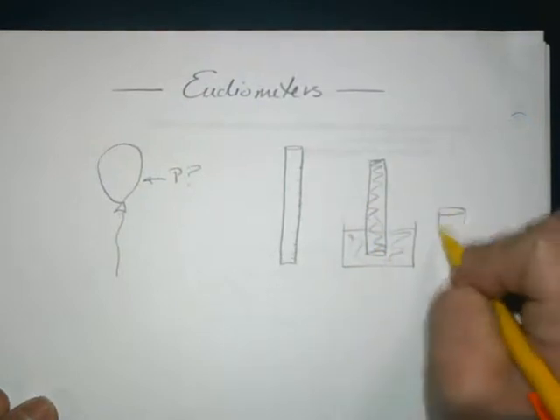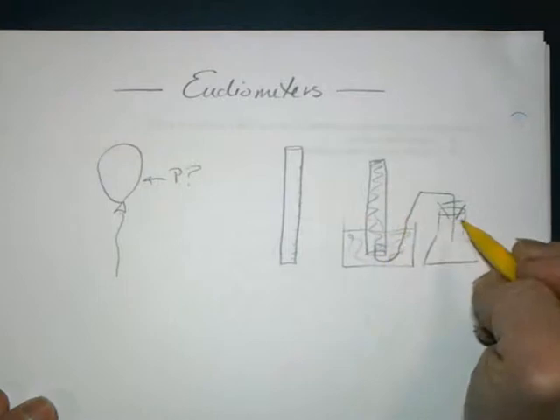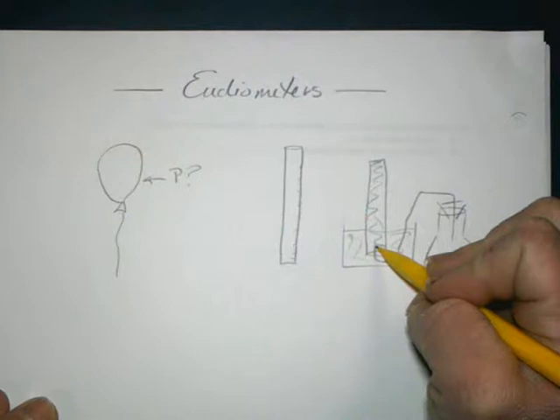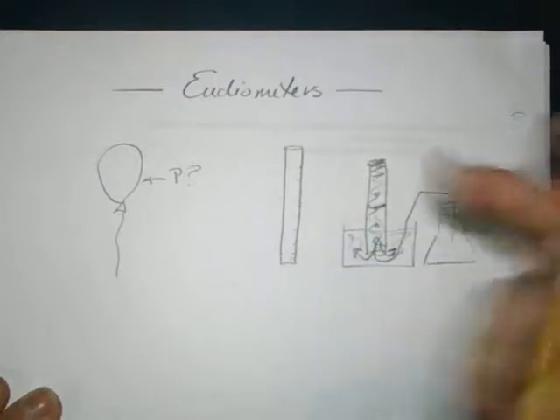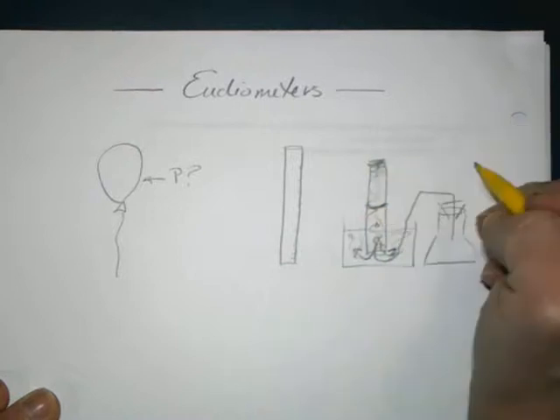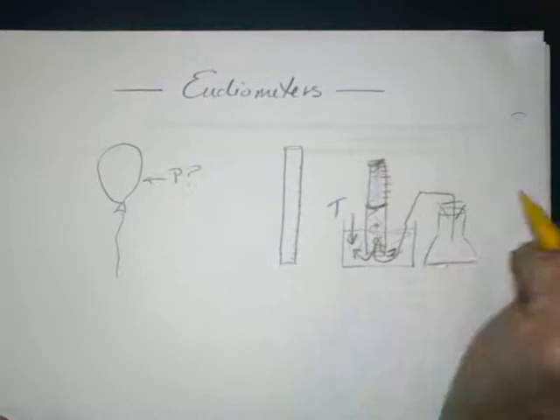Usually, you're doing some kind of reaction and then trapping the gas and forcing it through rubber tubing into the eudiometer. Through water displacement, because gases have mass and volume, of course, low density will cause them to bubble up. They then will collect and displace the water and will end up with an amount of gas inside of our eudiometer. To measure the temperature, usually, honestly, we're at room temperature, but usually we're going to measure the temperature of the water. We can get the volume by reading the graduations on the eudiometer.